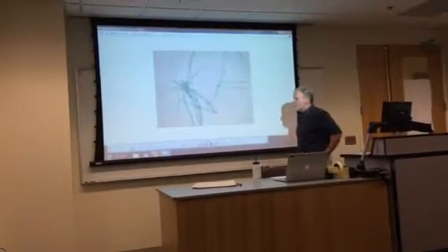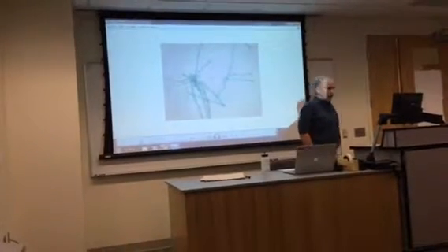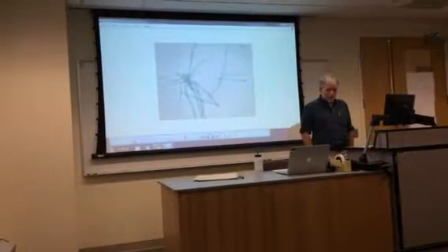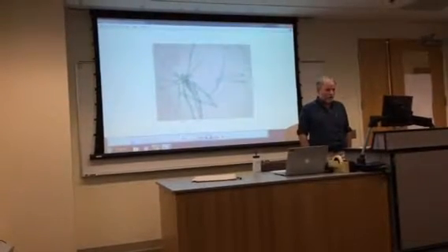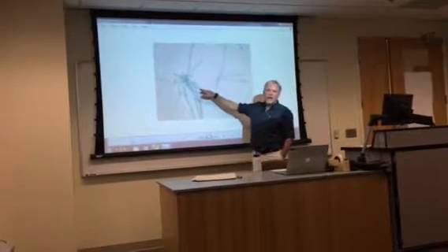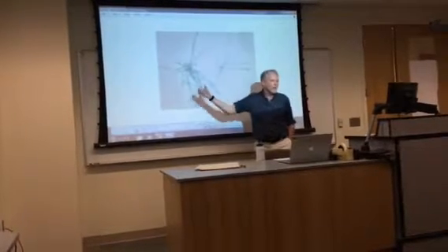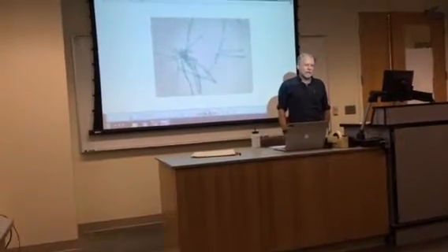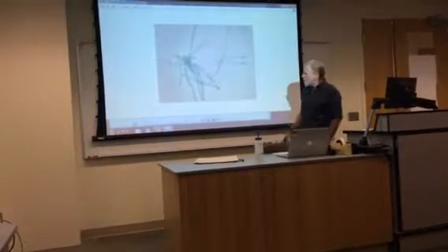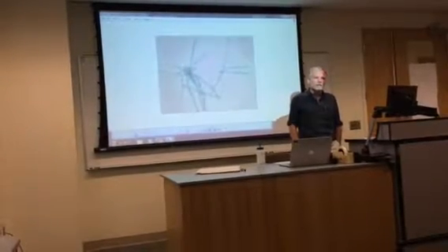All right, this is one of my favorites. This is called moss protonema. A spore is released from a true moss. It lands somewhere that's good for moss to grow, kind of moist. It's a haploid cell. Spores are always haploid. They divide mitotically, and they make a structure that's called a protonema. Later, after this gets to a certain size, it'll make the mature gametophyte. So it's an early stage of development of the gametophyte. It doesn't look like the gametophyte yet. What it looks like is a branched filamentous green alga.